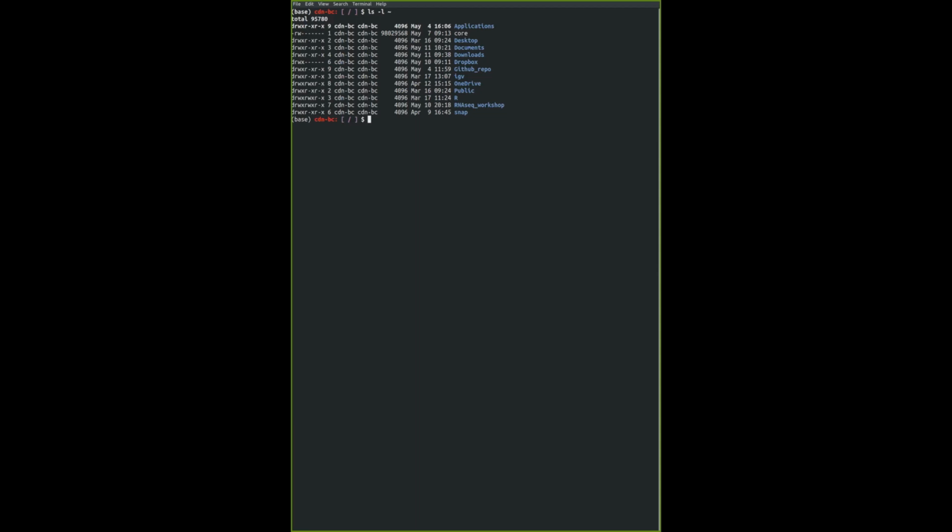Sometimes you may run into a problem of identifying where exactly, or what's the path for a certain directory. For example, you have a thumb drive or a hard drive, and you want to do some sort of manipulation in bash, and you don't know exactly what the path to that particular drive is. So I'm going to show you a couple of ways to retrieve that. It may be different for different systems. I'm going to show you the first way.